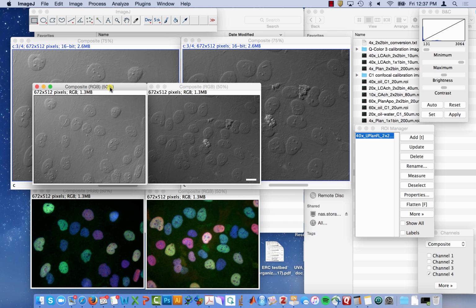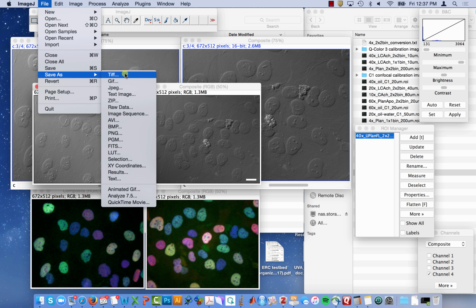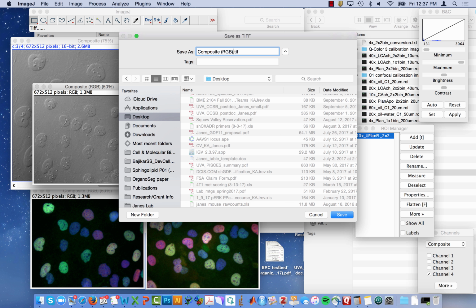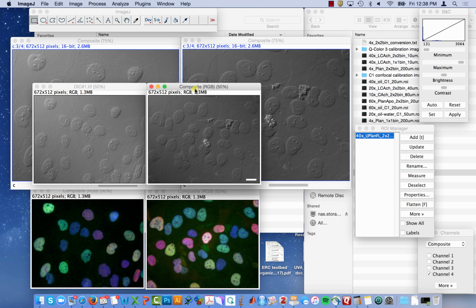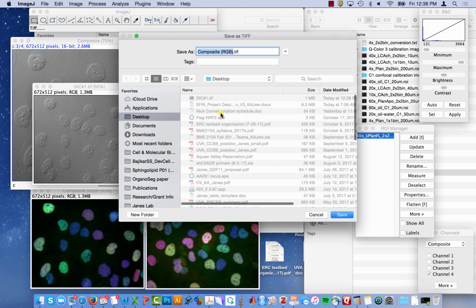Let me save each one of these. Save as TIFF, no compression. Composite, DIC number 1. DIC number 2.